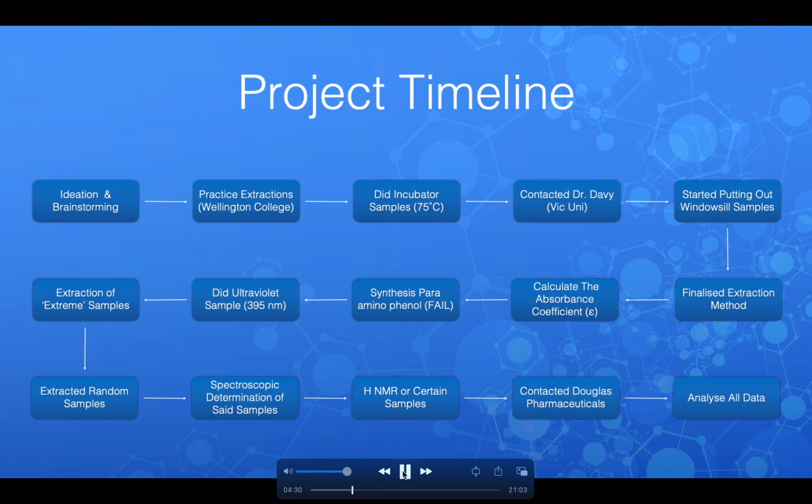I extracted the samples left for the longest amount of time in each condition. However, due to the weighing for the cuvette, some of these samples were inaccurate. I then carried out the weighing and analysis of more samples from my different environments.